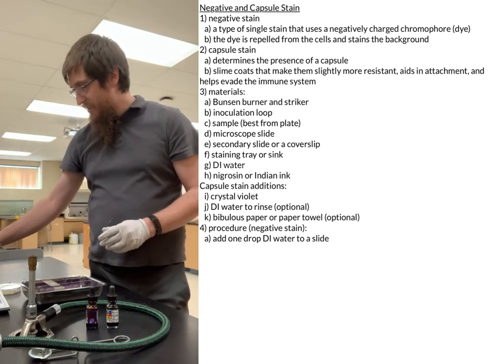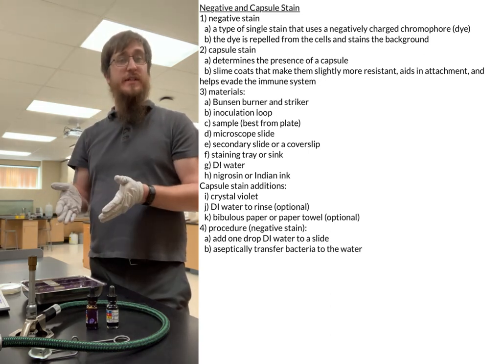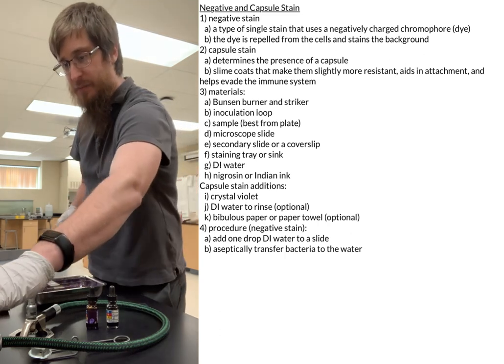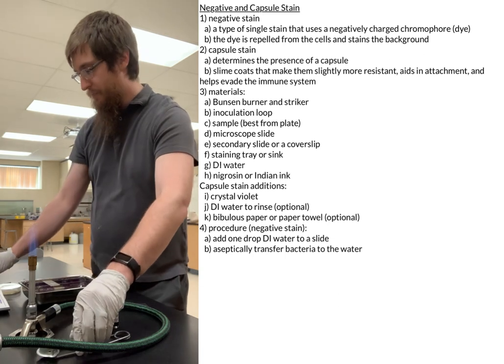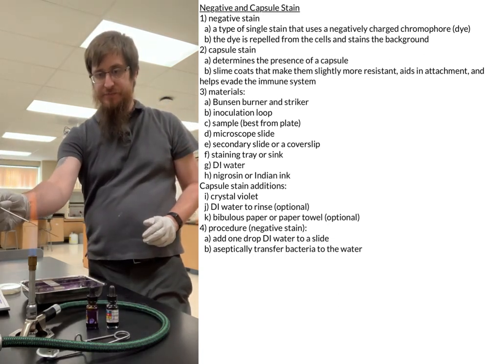And now I'm done with this guy. The next thing I'm going to do is aseptically transfer my bacteria into that drop of water. So let me get my Bunsen burner going. Here we go. I'm going to flame my loop.